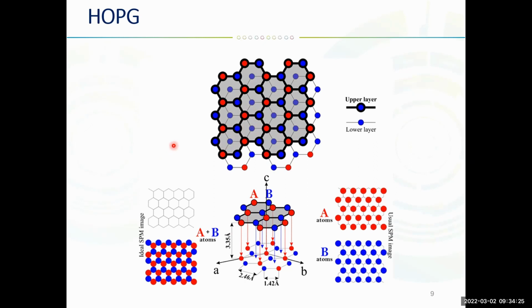This material as a layer is an excellent substrate for scanning probe microscopy, STM and AFM, as I already mentioned. There are experiments assessing how flat it is, and the question is: can we image it with atomic resolution with STM, for example? In atomic resolution with SPM, we can get two possible images: either the red A atoms, or only the B atoms in blue.